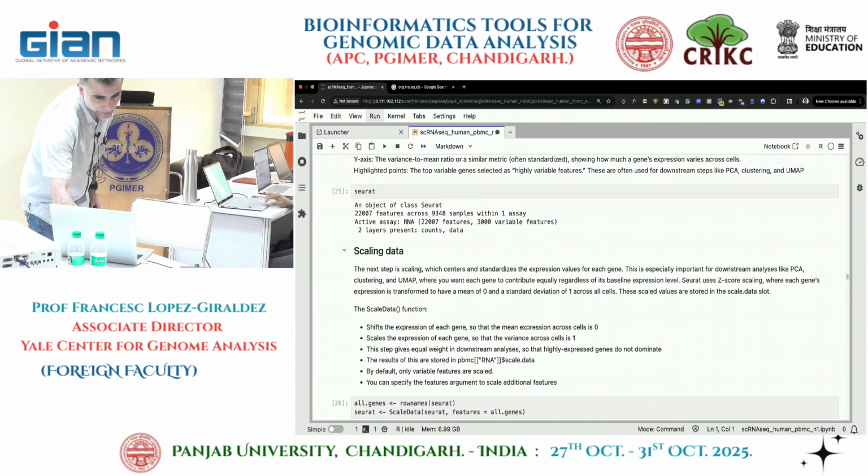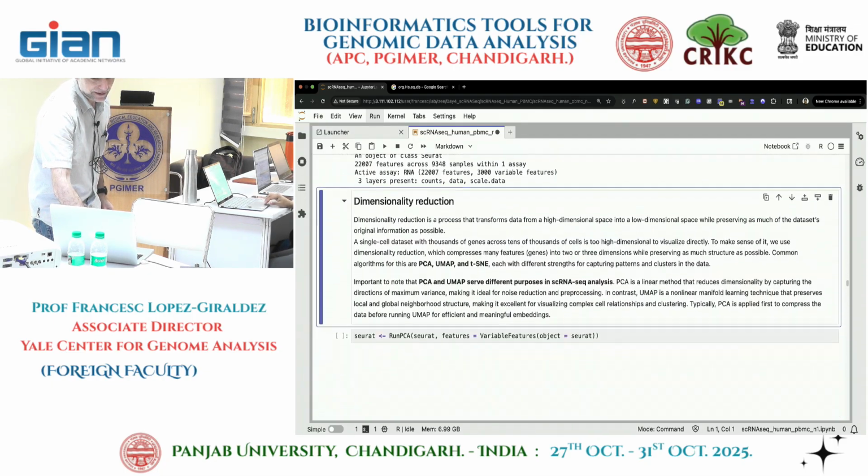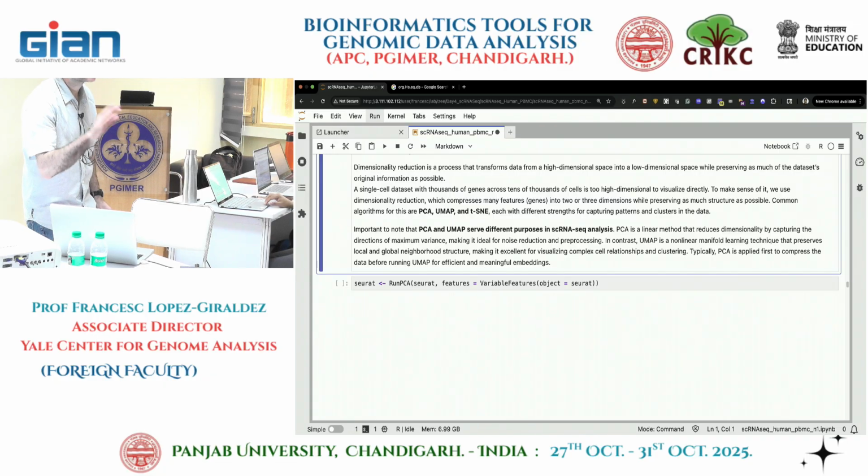Again, any questions? I probably give more details in the text than what I'm talking. And as I mentioned earlier, you probably can skip all this and go to the other type of normalization, and you do it in one step.